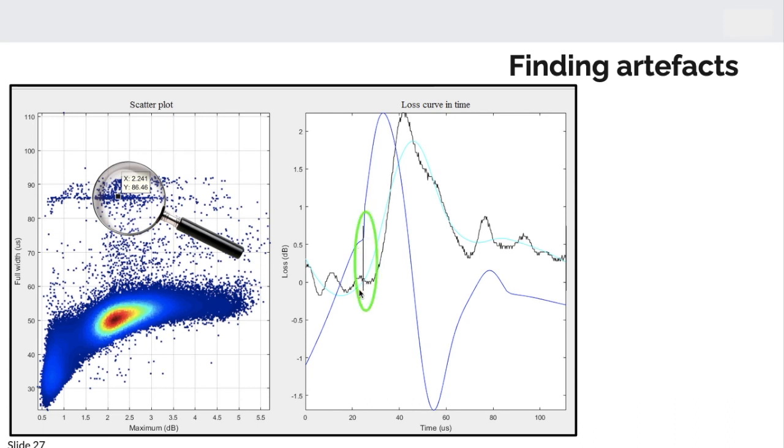at this point, the vertical bar, so the start, is here, but the ending seems to be absent. And actually, one could say that it's here, but we're not entirely sure, so we can manually confirm and verify. So how do we do that? Well, we go onto the scatter plot, and we can see that Rick has associated the full width of this point at about 86. Just for comparison, the common data points in my sample are about 50. So really, they're high up there.